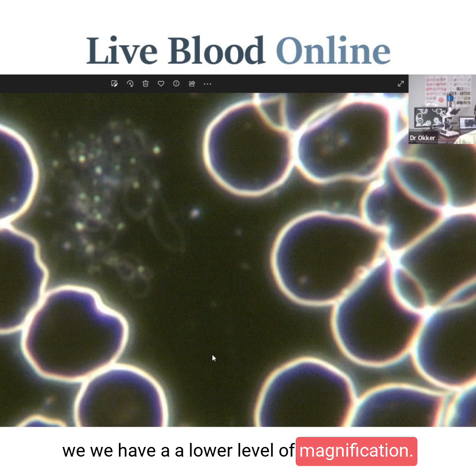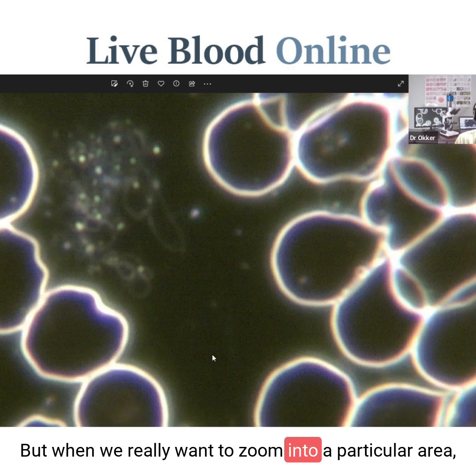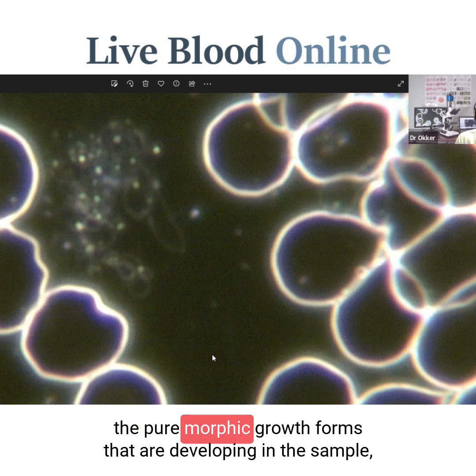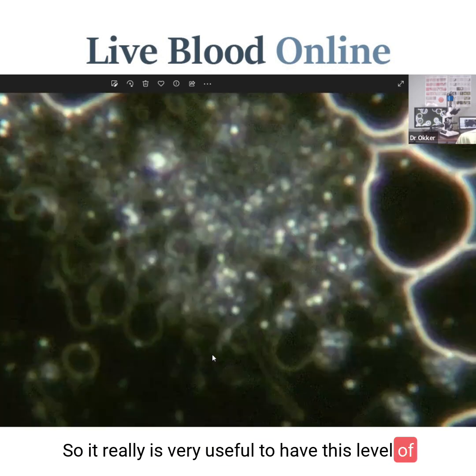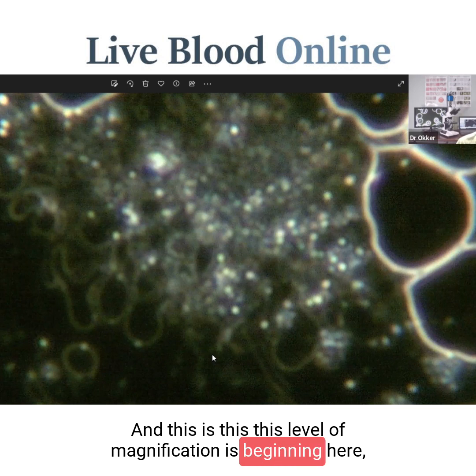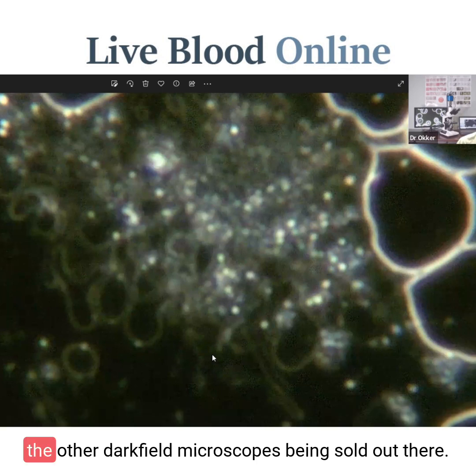The magnification achieved with the 40 times objective is ideal for normal dark field analysis. But when we really want to zoom into a particular area and look at pleomorphic growth forms developing in the sample, this 4,000 times magnification is what we then need. This level of magnification is not something that is available with any of the other dark field microscopes being sold out there.